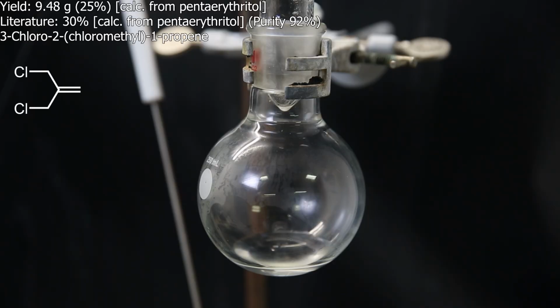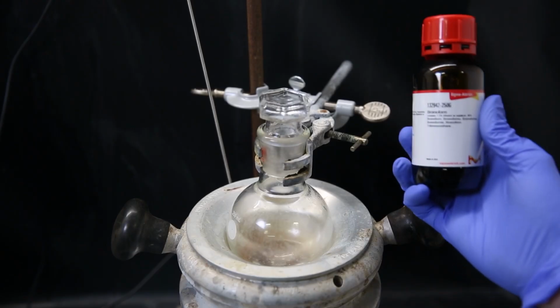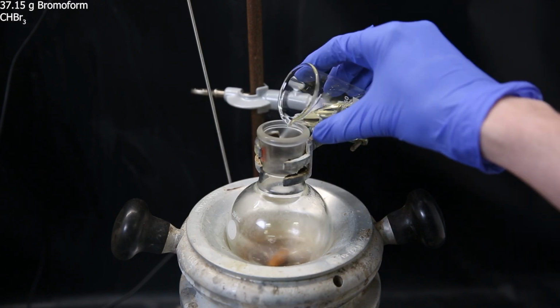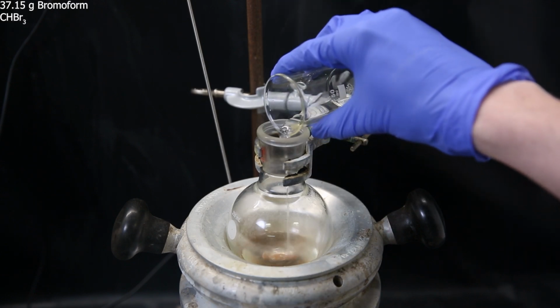In the receiving flask, I am left with 9.48 grams of a clear liquid, which is mostly the product 3-chloro-2-chloromethyl-1-propene. I calculated the yield to be 25% from the starting material, which is slightly lower than the literature, so it's not that bad. Now for the next reaction, I will have to form the dibromo carbene, which is done with bromoform, so I add 37.15 grams of bromoform to the previous product.